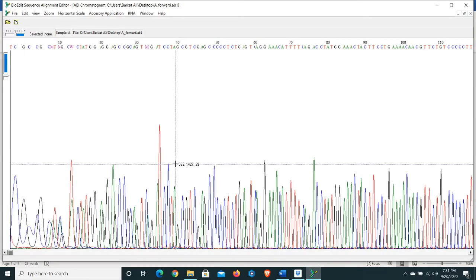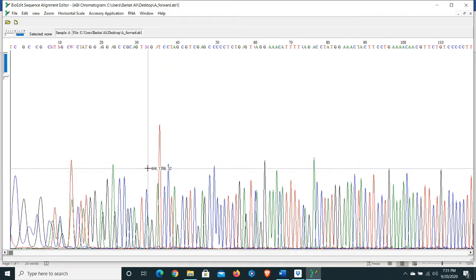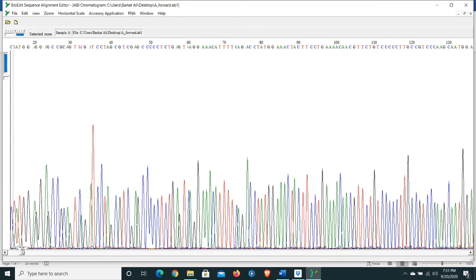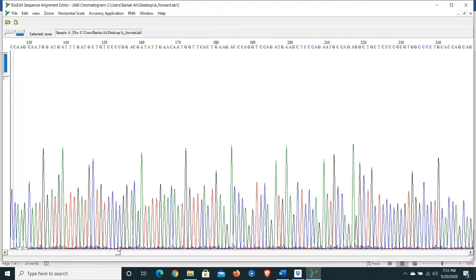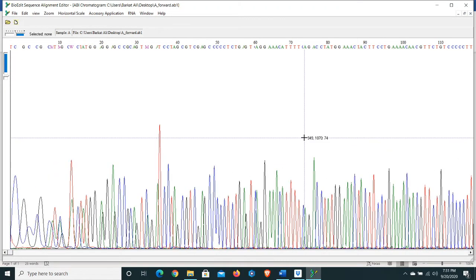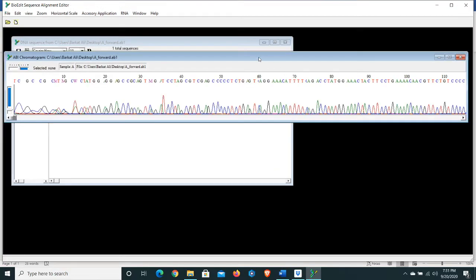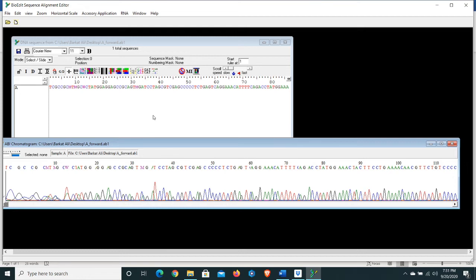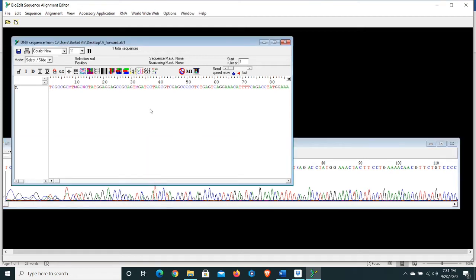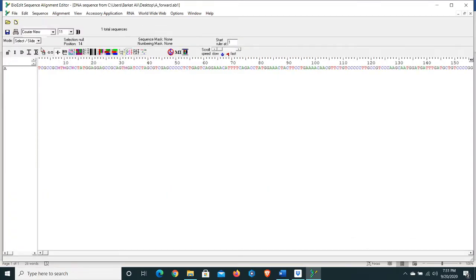We have looked at the chromatogram for our forward sequence, and especially at the beginning and end the sequences are not good. As we have recorded, let's zoom in. There is another file for the forward sequence where we can make changes — zoom over it and from Mode select the Edit option. Now you can make changes in this sequence.